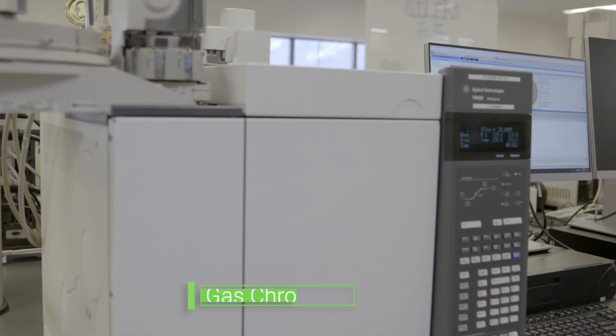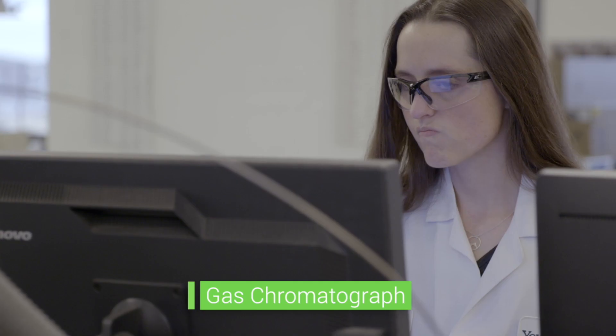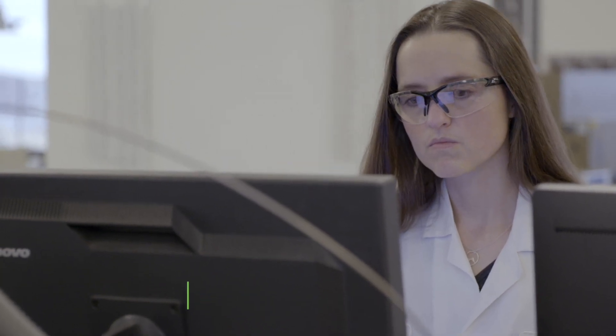Down here is another suite of instruments that we call gas chromatographs. We can measure thousands of different impurities with these instruments. They're extremely sensitive and very accurate.